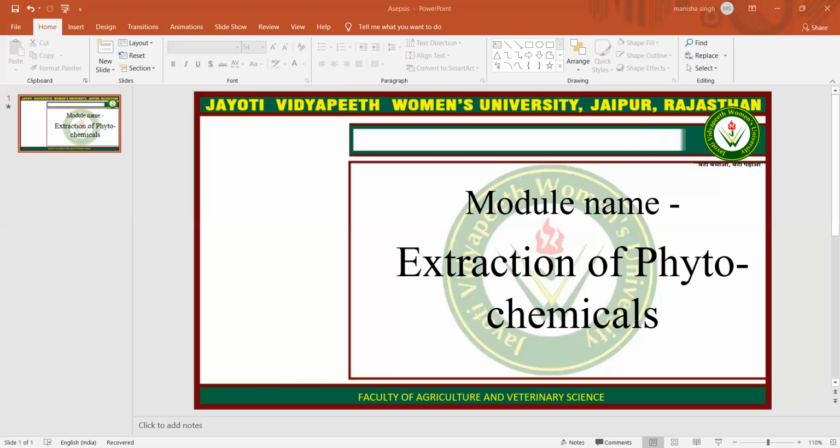Next solvent is acetone. Acetone dissolves many hydrophilic and lipophilic components, a very useful extractant, especially for antimicrobial studies and extraction of tannins and phenolics. And aqueous acetone is much more soluble than the aqueous methanol, and both acetone and methanol were found to extract saponins, which have antimicrobial activity.